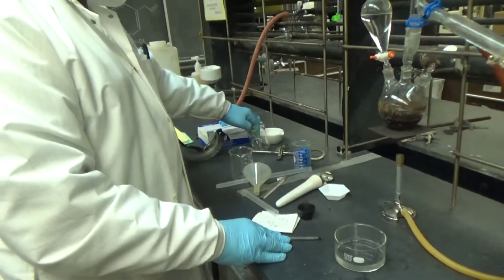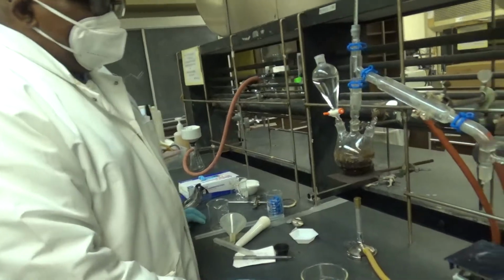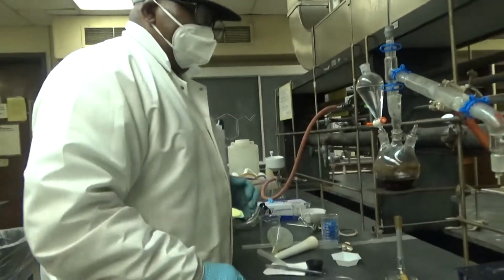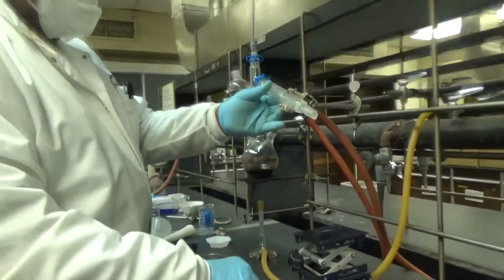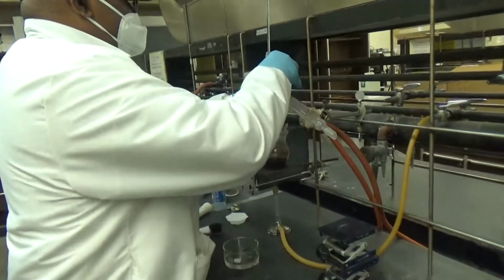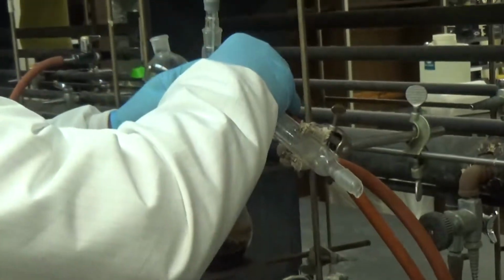Cool. Alright. So now the next part, I'm going to show you how to disconnect everything. Be really careful, everything's expensive.